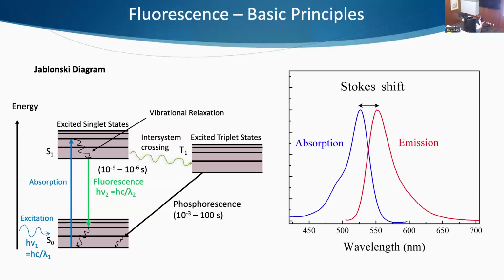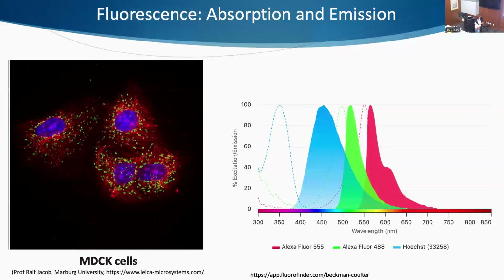The shift is called the Stokes shift, and this really helps. The larger this Stokes shift, the better you can separate emission from absorption.